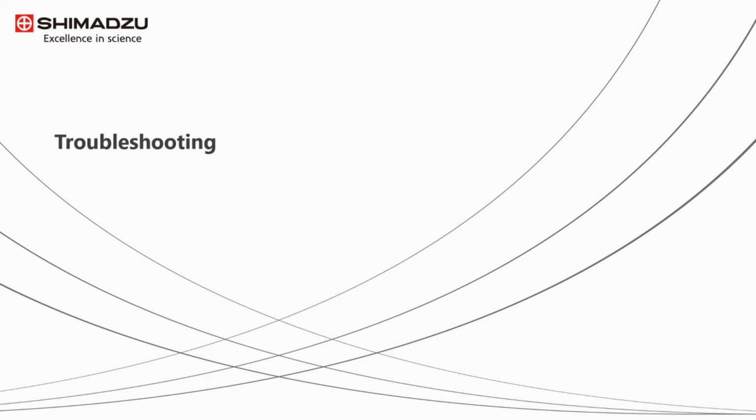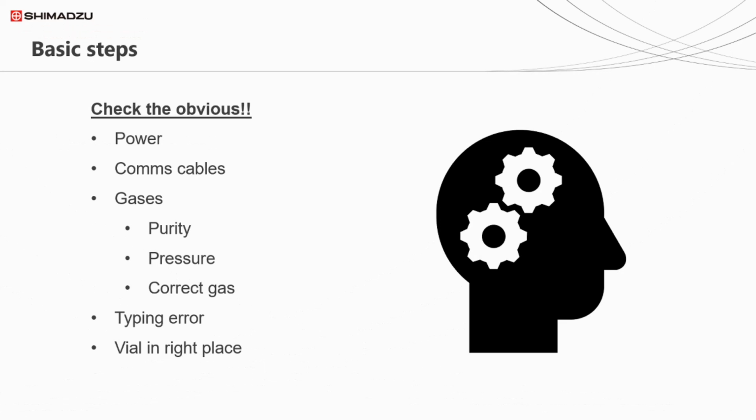Troubleshooting is something that you can spend an entire lifetime learning, and no amount of time would allow us to fully train you on how to do it, but hopefully this short introduction should act as a good start. Believe it or not, the overwhelming number of technical issues in chromatography are, yes you guessed it, human error.